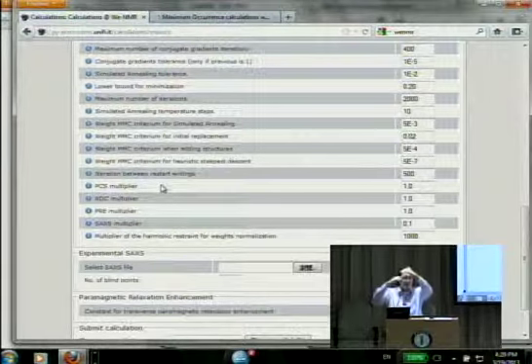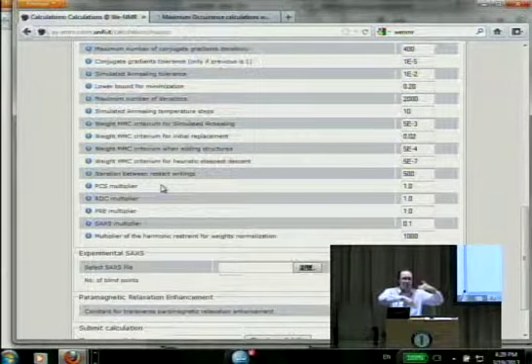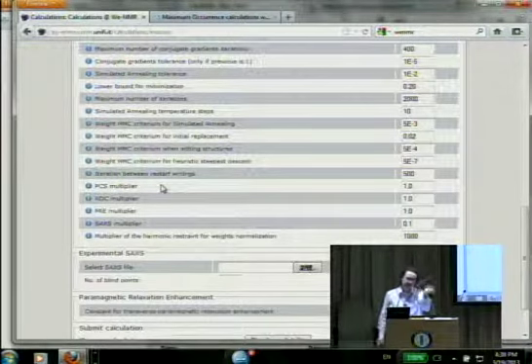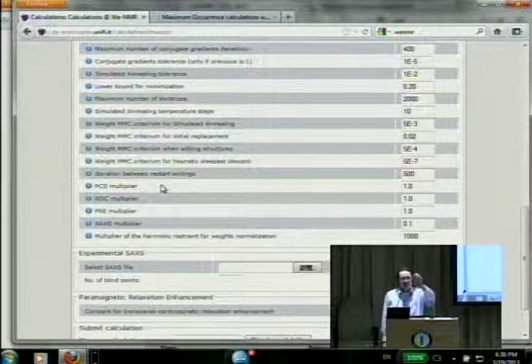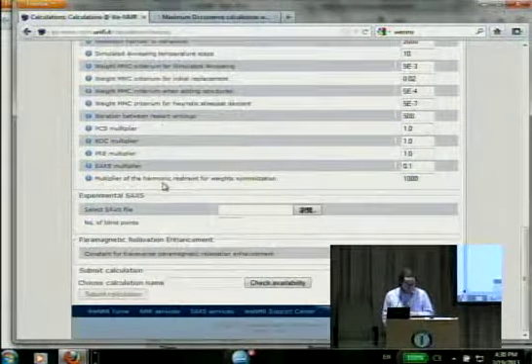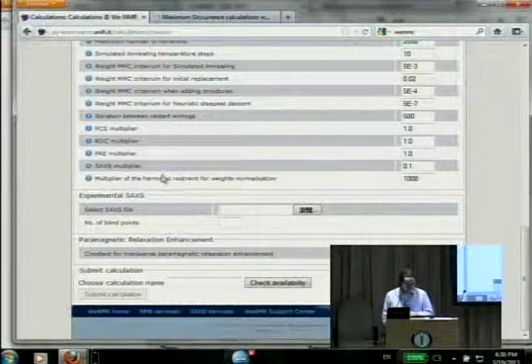And at this point, you can actually also add the SAXS data. We add them only now because we don't need to pre-calculate them. They are there, and the program that does the calculation of the profile is fast enough that we can just do the comparison on the fly.